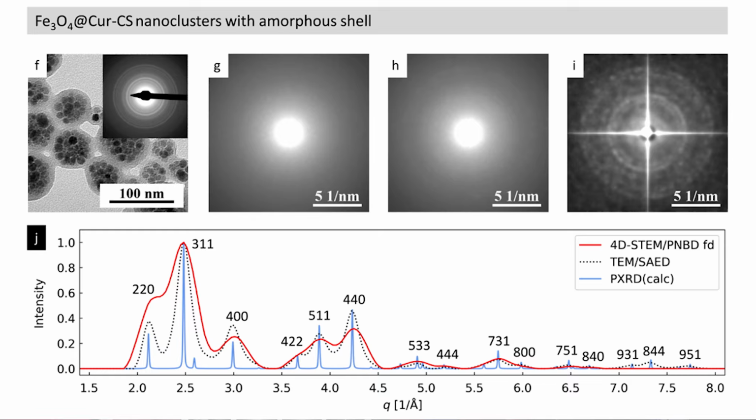The same, if we do filtering, it will not help us. If we do the deconvolution, it's much better. Not as nice as in the case of TEM, but still enough to identify the crystalline structure. And this is the thing that was not possible in SEM microscopes previously, to identify the crystalline structures. This makes the SEM machines comparable to TEMs. And I guess at the same time the TEM machines are much more costly.